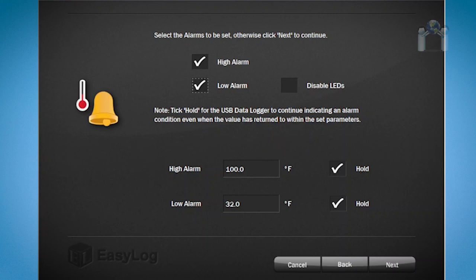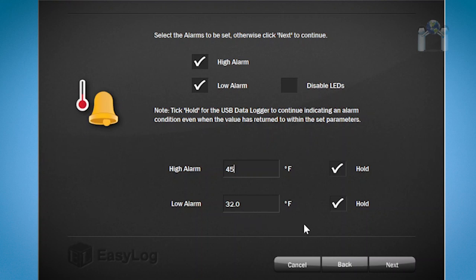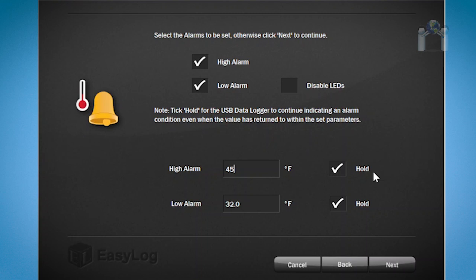Since I checked both alarm boxes, I will need to configure when to activate the alarm. Starting with the high alarm, I will select 45 degrees. For the low alarm, I'll keep it at 32 degrees. You may have noticed there is a box to the right of the temperature alarm settings with the word hold next to it. If you want the data logger to inform you of an alert condition, even after conditions return to normal, check the box. This can help you in case something happens such as a temporary loss of power.